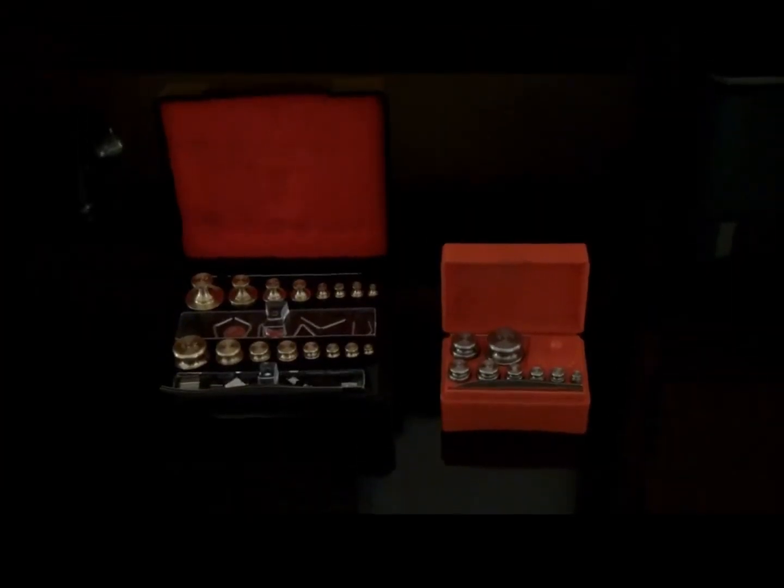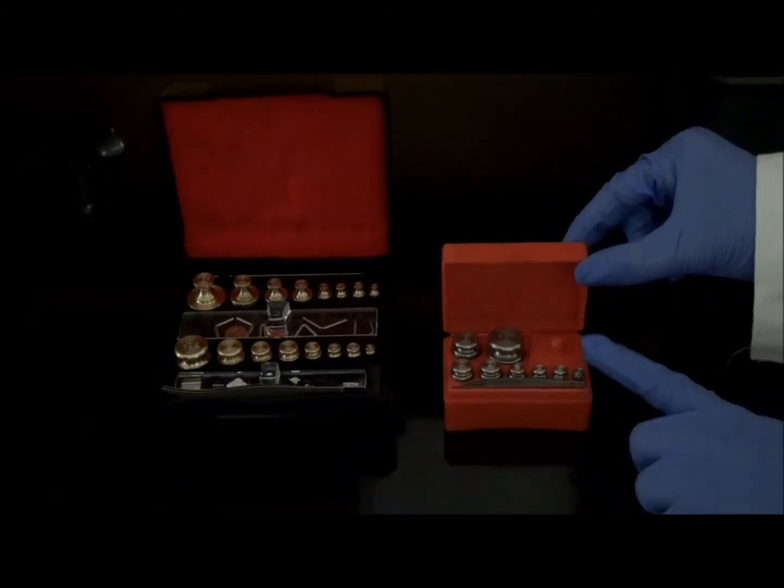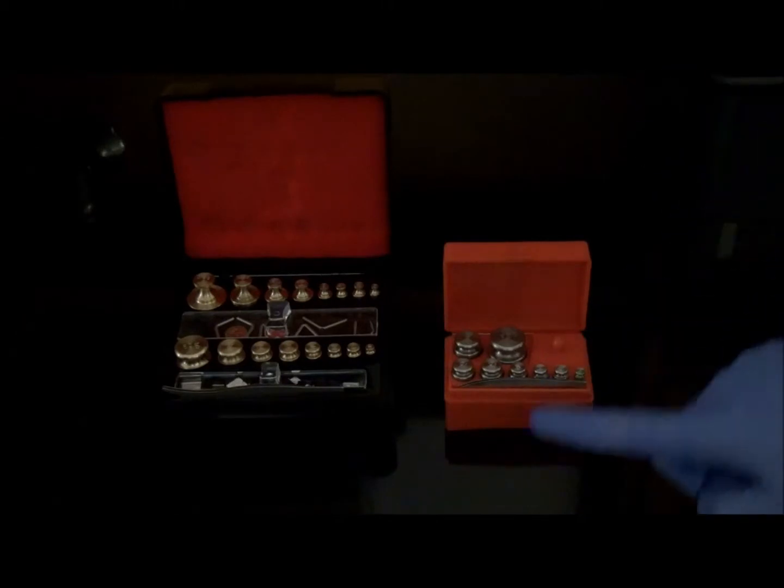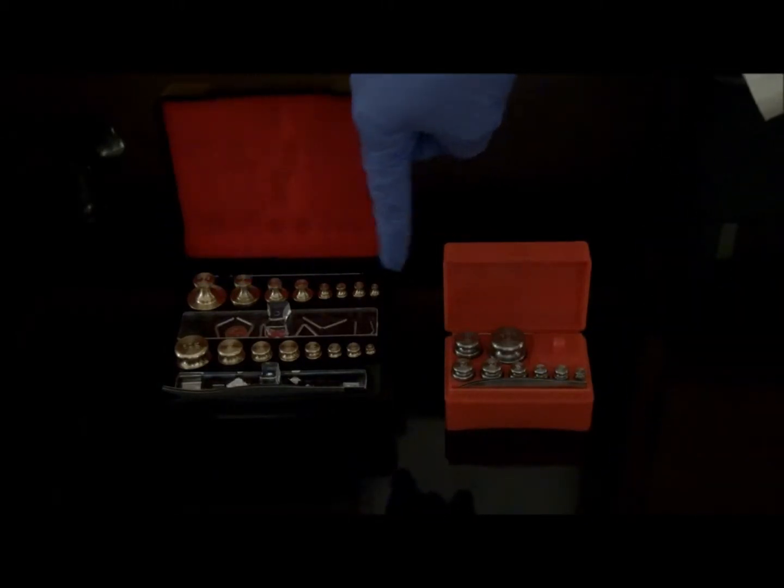We will be focusing on the metric and apothecary systems in this video. Metric and apothecary weights are packaged as a set in a sturdy compartmentalized box. Newer sets consist only of metric weights as there is a decreased need for apothecary weights in modern practice.